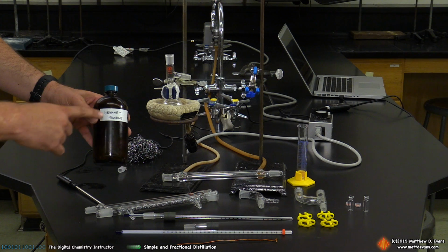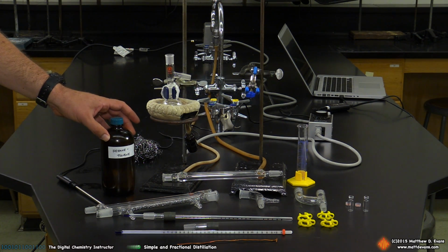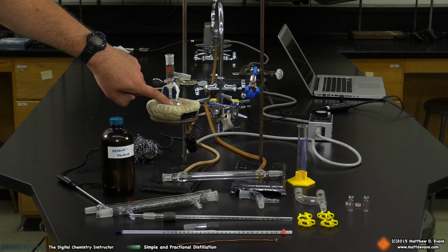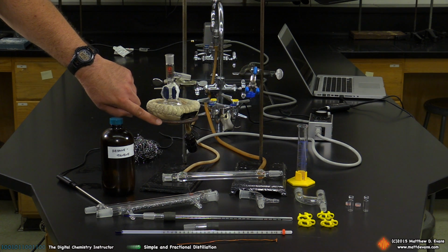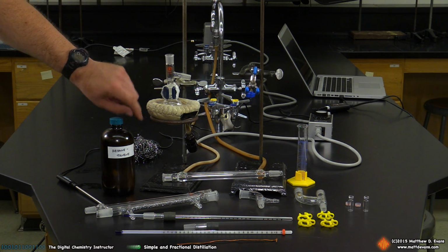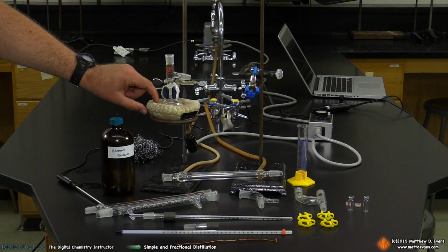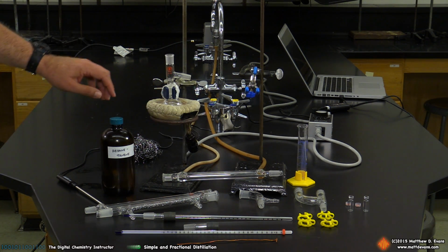I've already done this, so I know what this mixture is, but I've already taken 28 milliliters, according to the procedure, of this into a 50 milliliter round bottom flask that you can just barely see in this video. In addition to that, I've got an iron ring, which are available in the cubby holes in the front part of the laboratory. Heating mantles, this is what we always use for distillation. These are available in the back corner of the laboratory. You're going to need a controller for that heating mantle, also in the back corner of the laboratory.